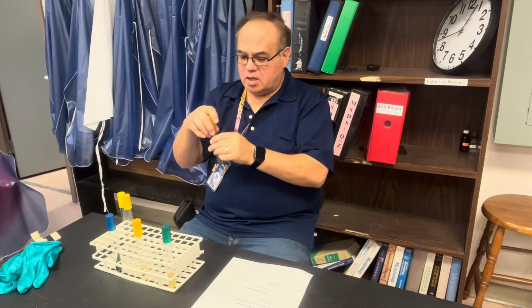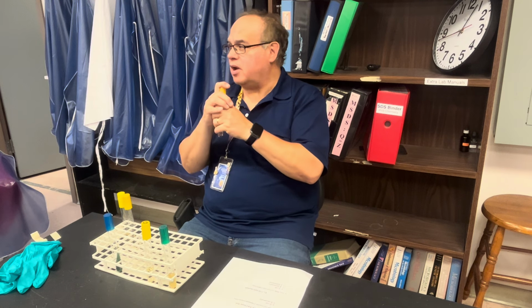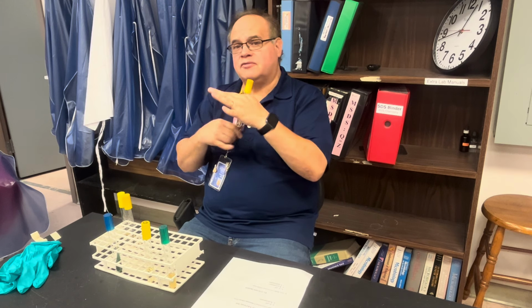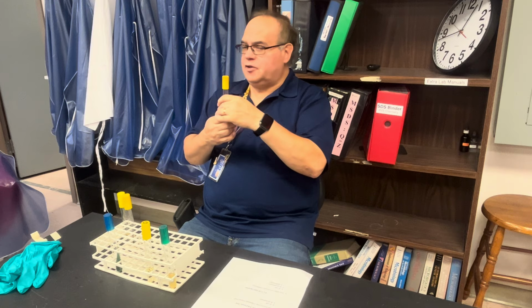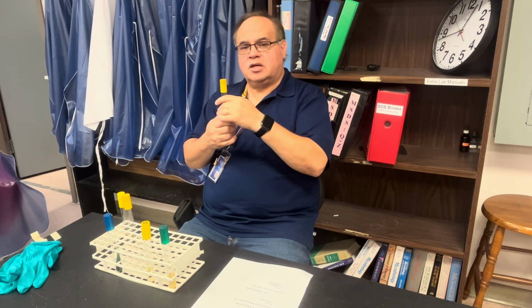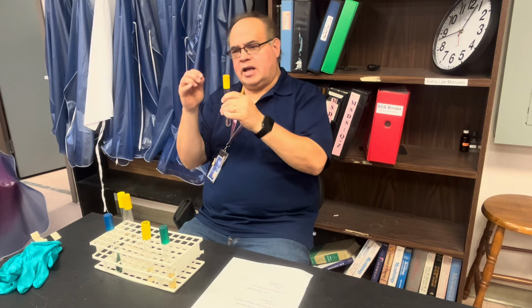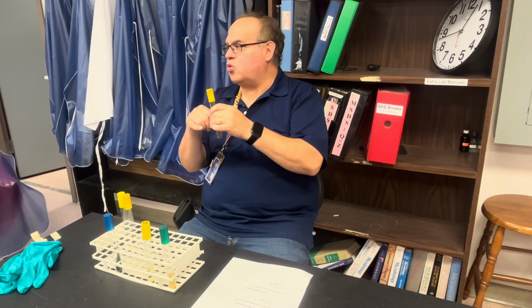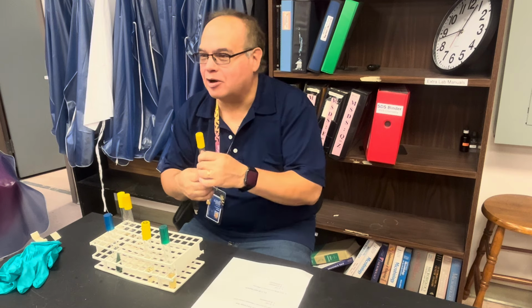Okay? You're still going to run the other one. The other one is called the VP. It tests for neutral end products. So here, on Thursday, you're going to add 15 drops of potassium hydroxide, 8 drops of naphthol. But it takes forever. So we're going to add a catalyst. The catalyst is called creatine.